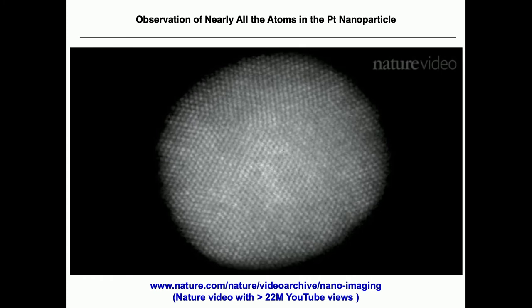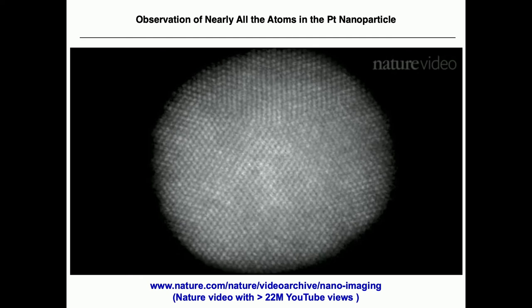One group from the University of California in Los Angeles have been getting up close and personal with nanoparticles of platinum, just a few nanometers across. Each of the tiny dots you can see here are actually individual platinum atoms.